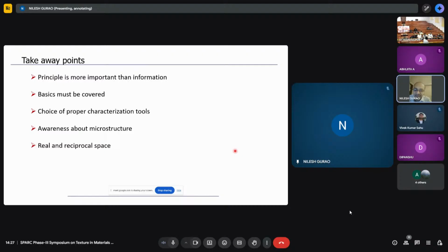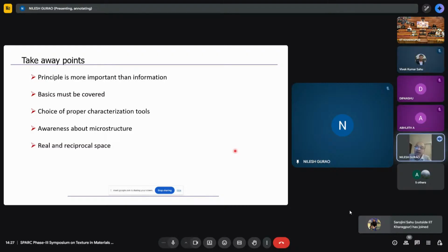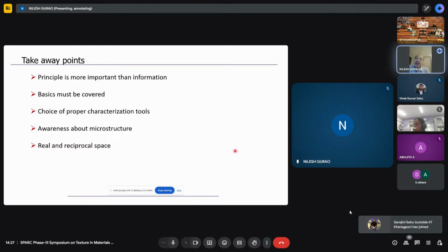The other two images are SE and BSE images. Yes, very good. Now you tell me, which has a better spatial resolution? So we all agree that the secondary electron image has a better spatial resolution than the backscatter electron image, because the secondary electrons are coming from the top 50 to 500 angstrom, and the backscatter electrons are coming from about 1 micron to 5 micron depth, right? They are coming from a larger volume.